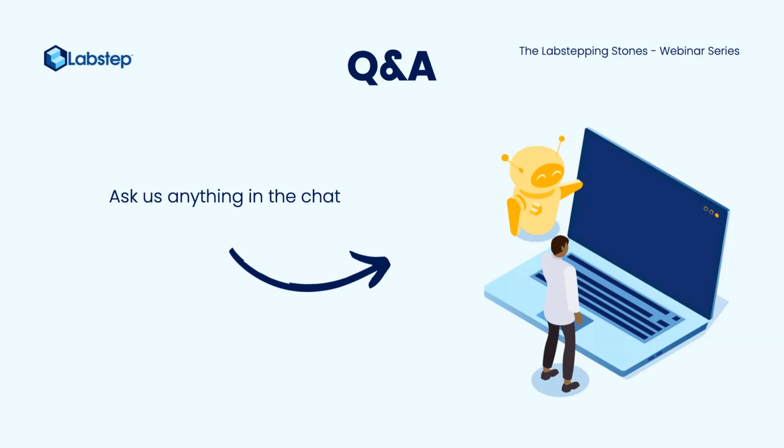Another one from the Q&A. Do you have to always enter all of the information you need with each resource in your protocol, or can you vary the levels of detail? Okay, I understand that one.